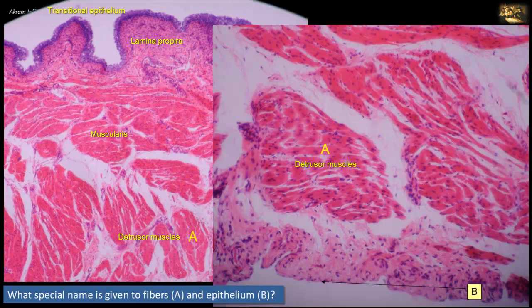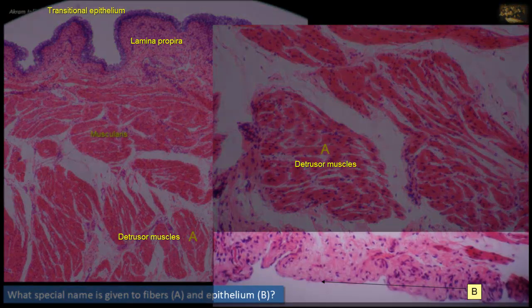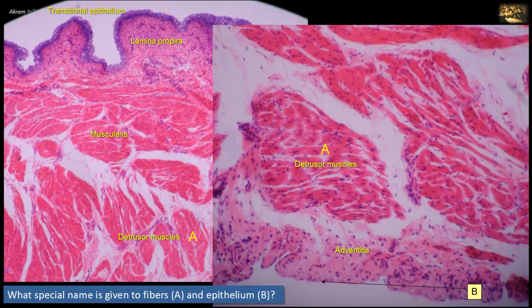The third and outermost layer in the wall of the urinary bladder is shown in the photomicrograph on the right. It is the adventitia, formed of loose connective tissue containing collagen fibers, fibroblasts, and blood vessels. In this section, the adventitia has an additional layer of flat epithelial cells called mesothelium, seen only where the urinary bladder is covered by peritoneum. Keep in mind that in all serous membranes — such as the peritoneum, pericardium, or pleura — the mesothelium secretes fluid and reduces friction between adjacent structures.